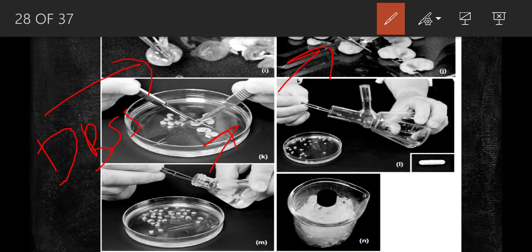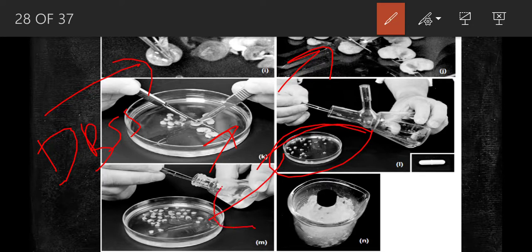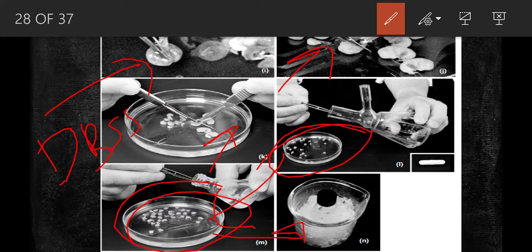If you want to collect a large amount of embryos and have to sacrifice many mice, at this step you take all these embryos and keep them in ice so the cells will stay alive for subsequent dissection and culturing.